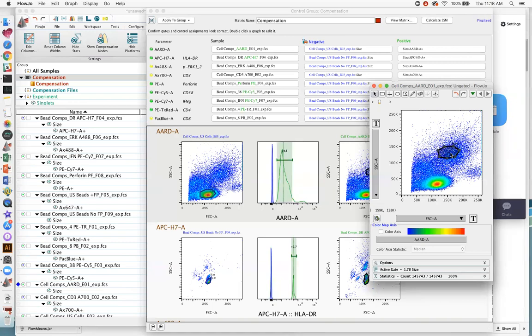Okay, these guys again are the monocytes, right? And they tend to pick up that dye a little bit, though they're not necessarily dead. There are some dead ones over here that are really bright. But the vast majority of the monocytes are healthy, but you can see here how they have that positivity associated with them. And another set of cells on this side are not very positive for AARD.